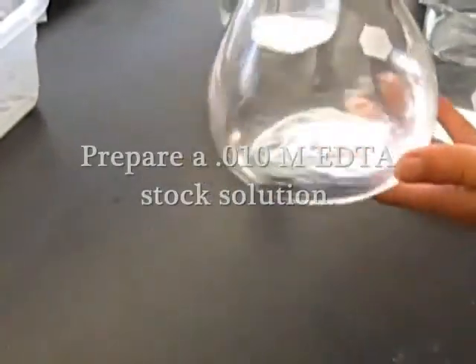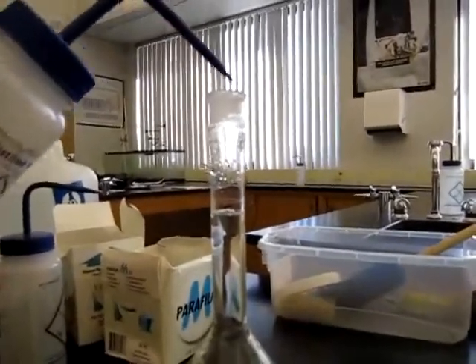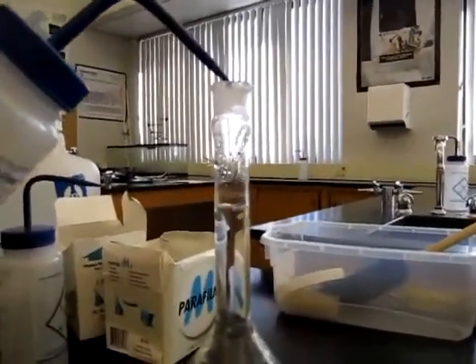Prepare a 0.010 molar EDTA stock solution by placing the solid in a 1-liter volumetric flask and diluting to the etch mark.